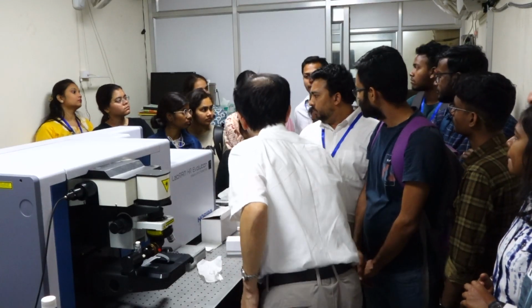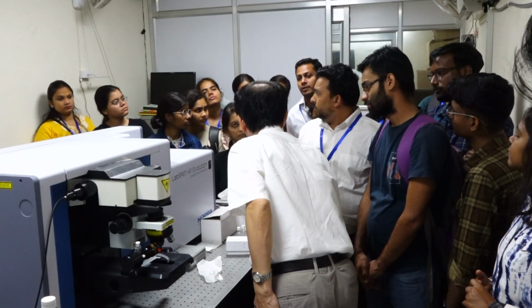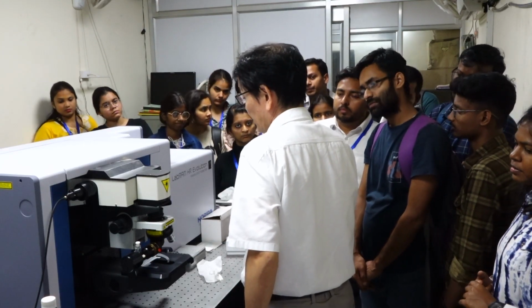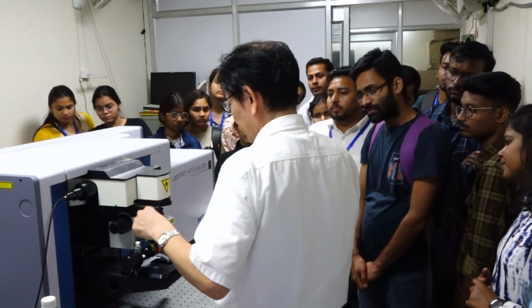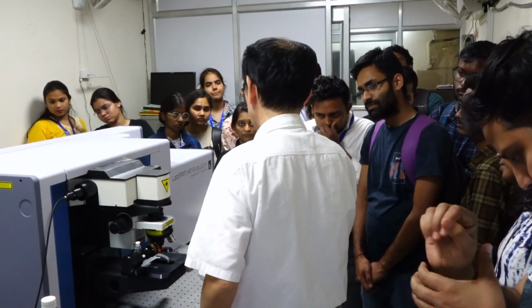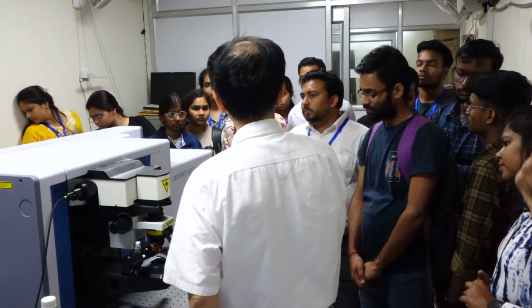Probably this machine can be used with all types of Raman spectra, either conventional or surface enhanced Raman. Can you measure all types of Raman from that? Must be possible. The surface enhanced Raman is achieved by adding nanoparticles into the liquid sample, but probably some stirring is necessary.